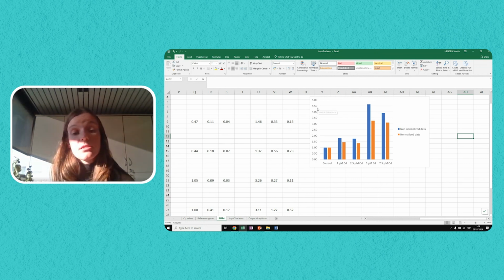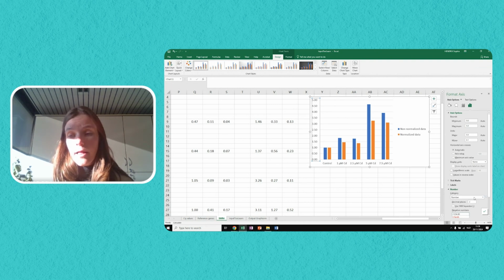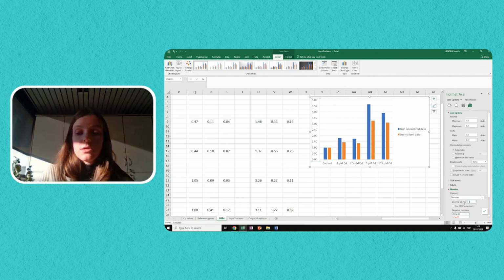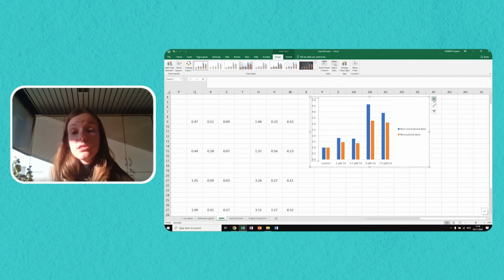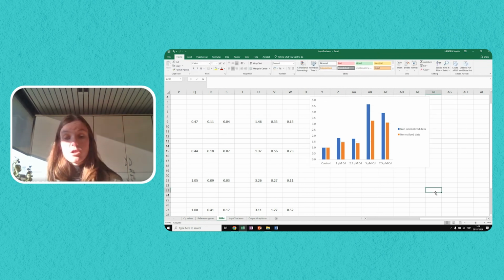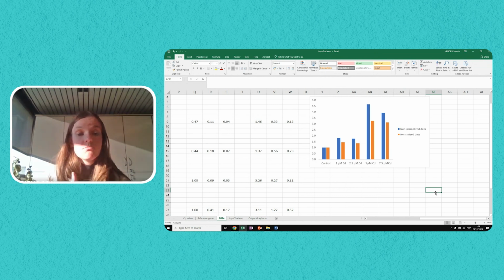Here on the y-axis, you can see that there are too many decimal spaces because these zeros here at the end don't have much meaning. So I will remove them. So I will add here that I want to use only one decimal in this case. I personally prefer to also remove the grid lines from the graph, but these are, of course, things you can all change as you wish, according to your personal preferences.